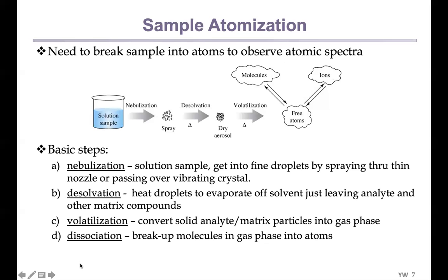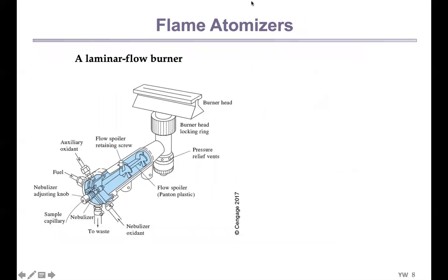Okay, now moving forward. Does it matter what solution our sample was dissolved in, like basic, acidic, or organic solvent?